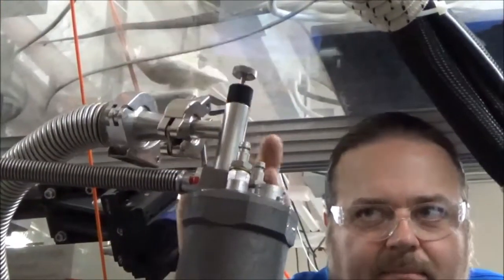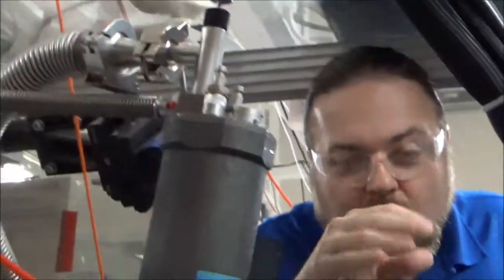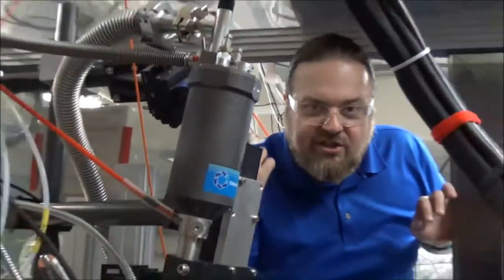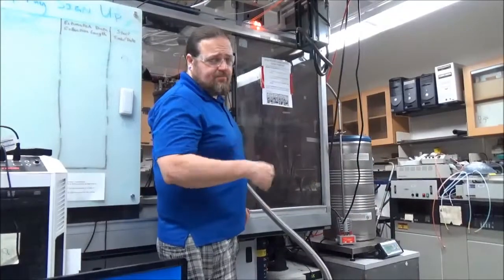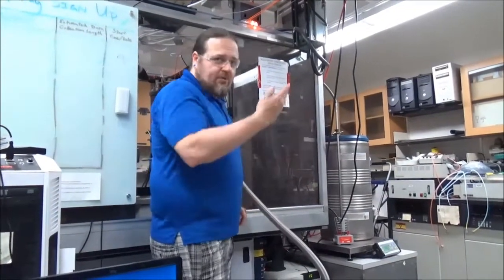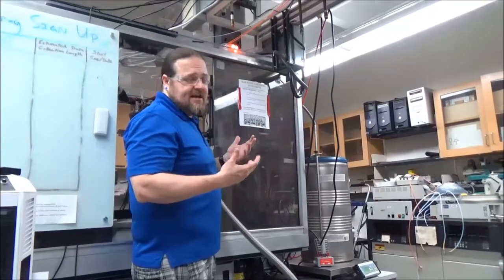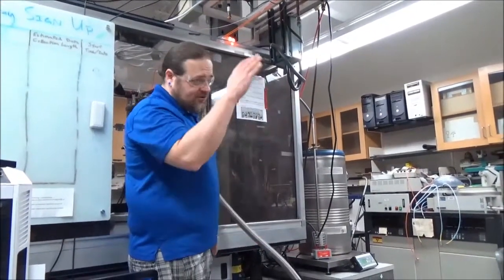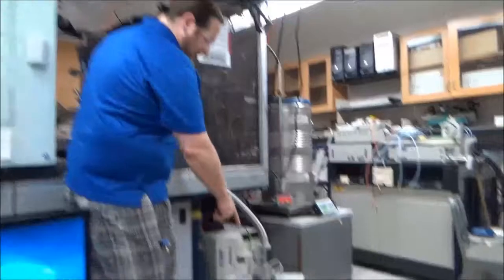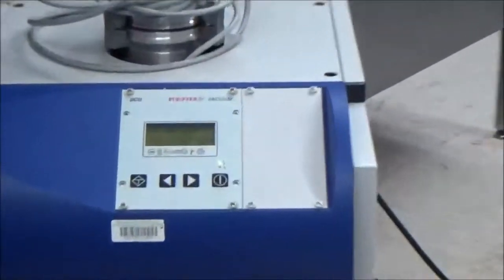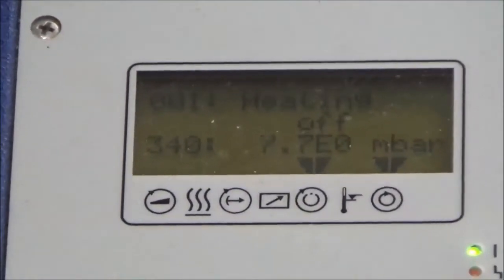Now, if I lifted this up, we would begin evacuating things. And I'm going to hold off lifting it up because I want to show the actual change in the vacuum on the gauge of the vacuum pump, as opposed to just showing me lift this thing up. So here we go. We're about to pull the plunger. You're going to see the vacuum go up and that's because we're pulling air and whatnot in that head space. I'm about to pull the plunger out and I'm pulling it out now. There we go.